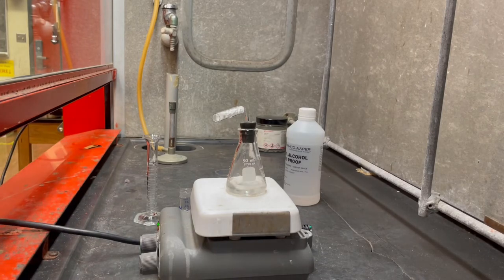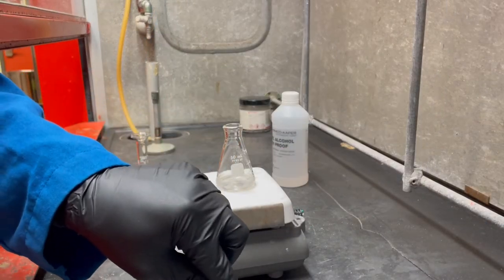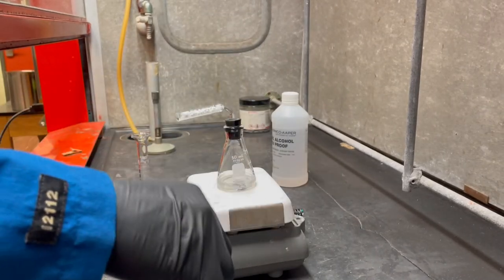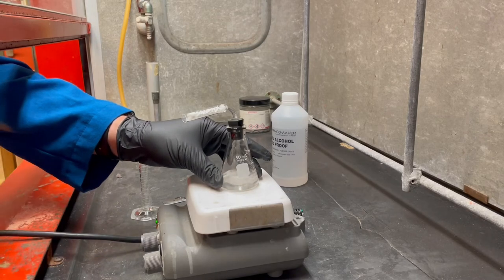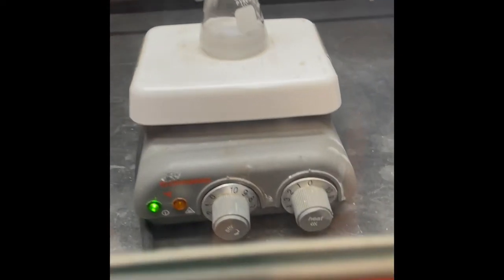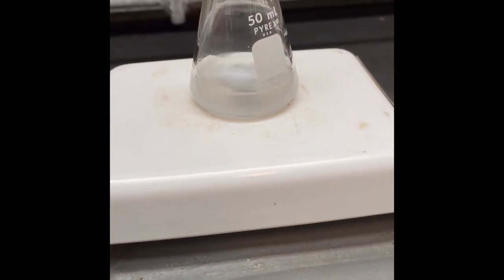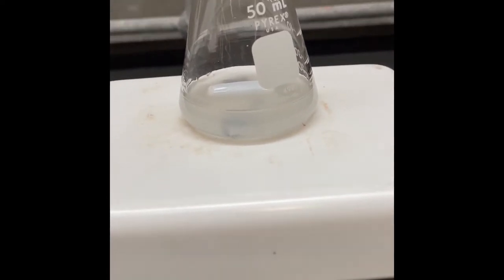So there we go. I was getting ready to add some more sodium, and then I realized I accidentally added a little bit too much. Mass is not important, but I added too much elemental sodium, so it might be an issue in terms of dissolving or whatever. All right, I basically just wanted to show you here. It's getting cloudy, a little thick. The rate of formation of those bubbles is actually really slow, so I think we're just gonna kind of cruise on through.